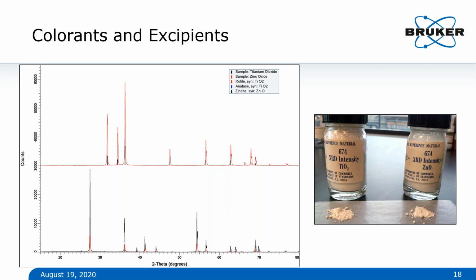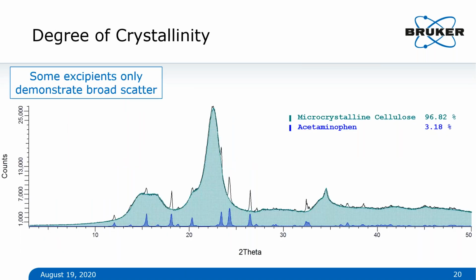Fantastic. Next question. If I am analyzing an unknown sample, how would I know whether the sample is crystalline or amorphous? Okay, simple as this. Do you see peaks? Yeah.